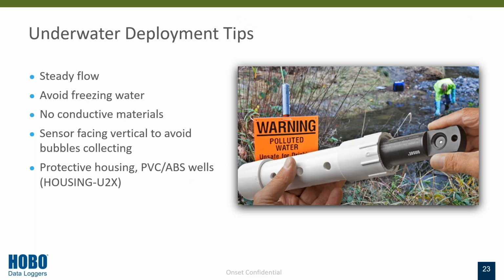Let's talk about some underwater deployment tips. When you're deploying loggers underwater, you do want to make sure you have a good steady flow. If you are experiencing really low freezing temperature water, you want to make sure that you are deploying the logger below that freeze line. We do not want that logger to be frozen.